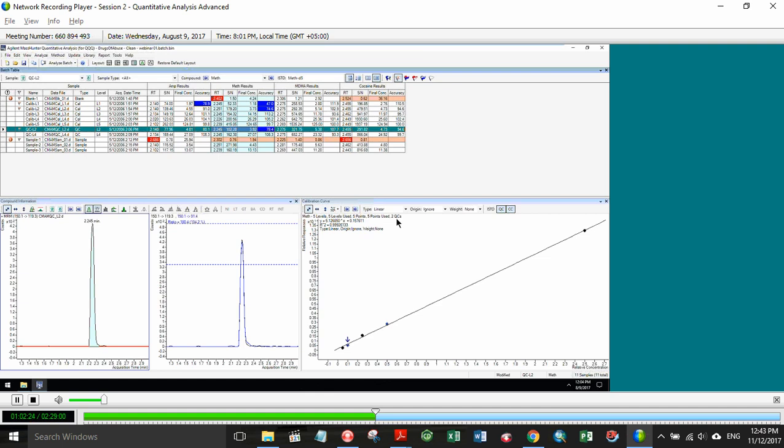This one user has an older version of MassHunter, B.07, which runs on ATM mode. Can they customize calculations based on what they need? Customized calculation was really a new field that was introduced in Quant B.08. Okay, so that would not be available in the B.07. In this case, I would probably either recommend upgrading the software to the B.08, or the possibility, again, is to export the table and then use Excel macros for that customized calculation.